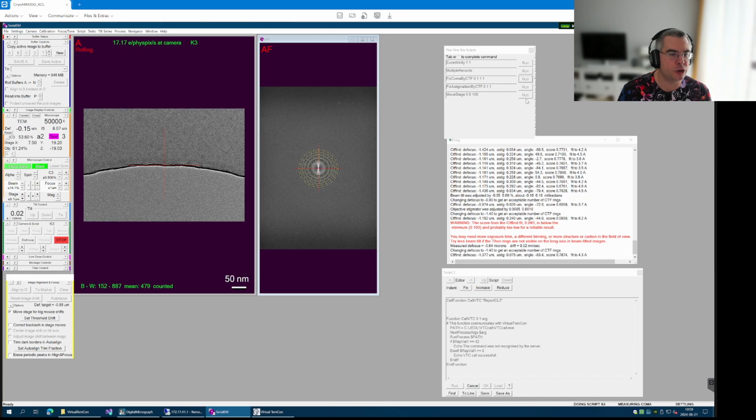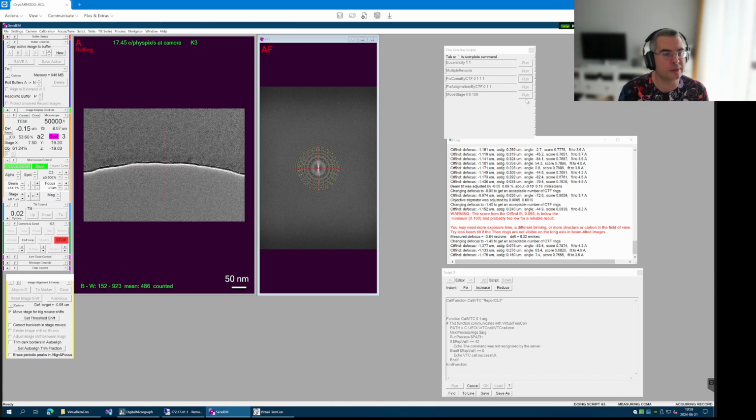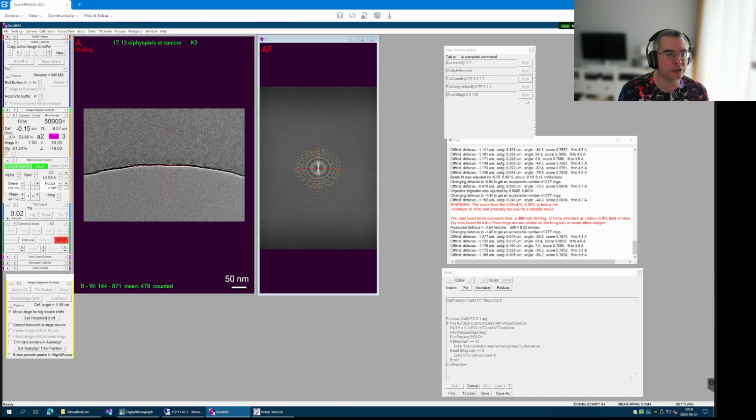Yeah, the first shot was difficult because on this cryo arm, when the fluorescent screen camera retracts, it causes a bit of vibrations. And we need to include a delay of around 2 to 3 seconds to let the microscope settle.